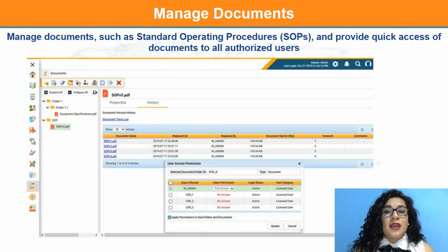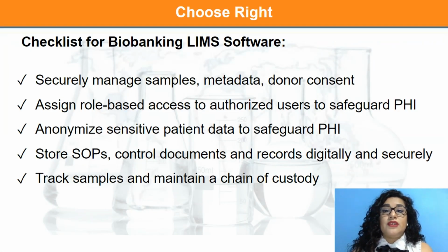So let's list the benefits of having a LIMS managing your biobank and how it fits with the requirements of ISO 20387.